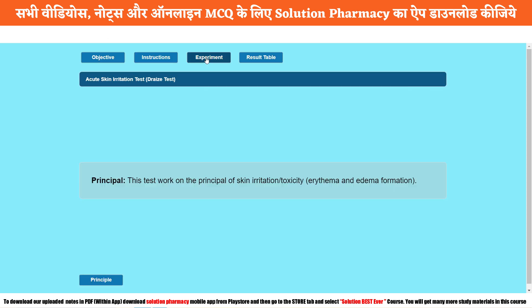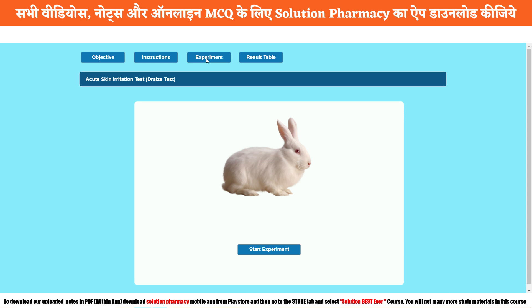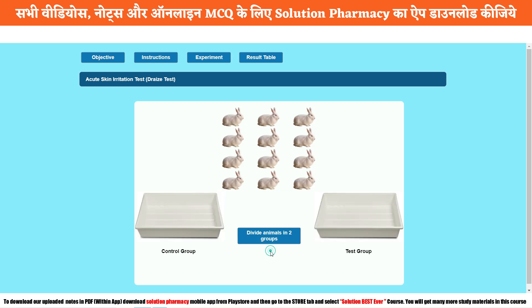Come to the main point — that is the Experiment section. Once we click the Experiment section, we see a rabbit. The rabbit is going to be used as an experimental animal because it is very easy to handle and has a large surface area. Now you can see there are 12 rabbits and we have to divide them into two groups — six rabbits will be placed in each group.